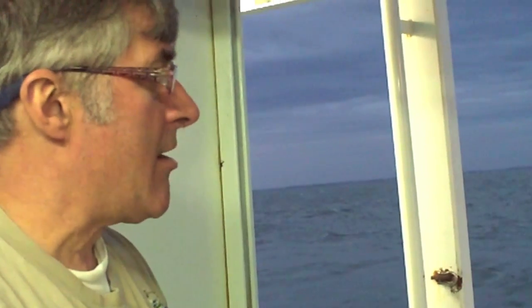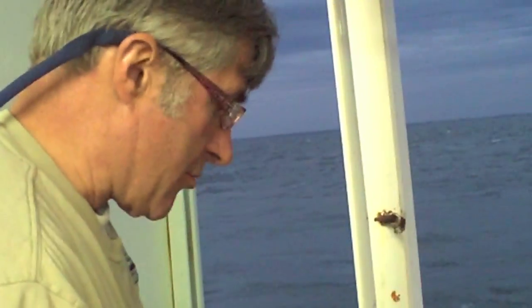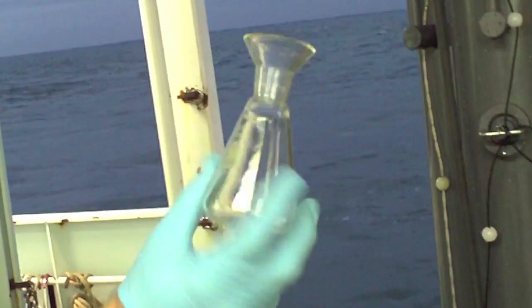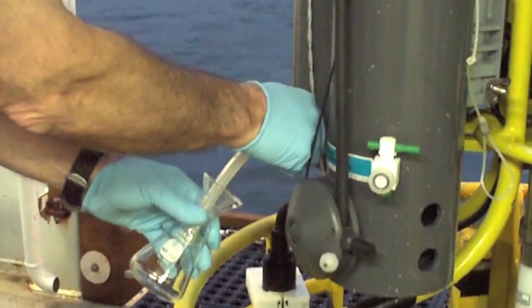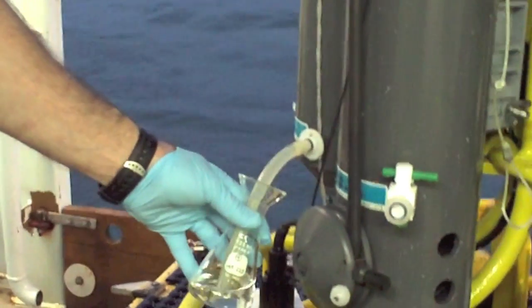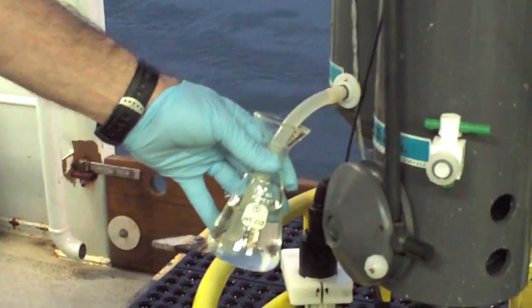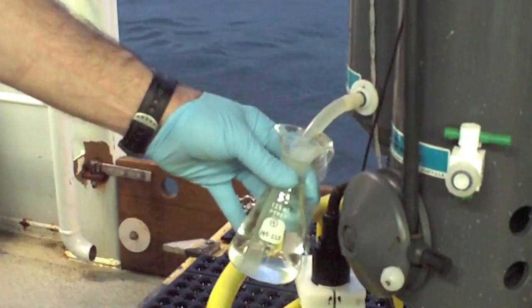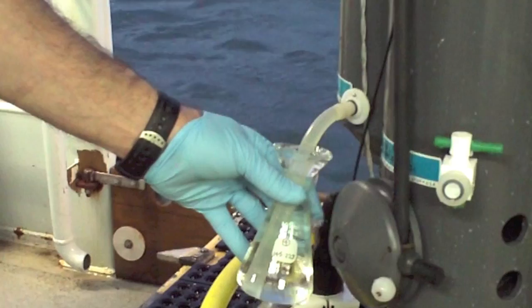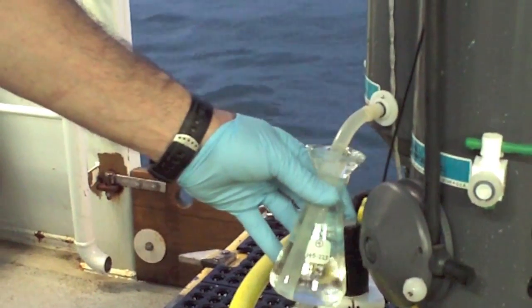It's the way we calibrate all our oxygen sensors, either on the CTD or on a glider or on a mooring. So what we're doing now is we're going to collect oxygen — you can see that there's oxygen in the sample. The way we get rid of air bubbles is we overfill this bottle at least three times. Typically what you tell people is to count to maybe 20, and that will do it. And then what we're going to do is we're going to add two reagents.